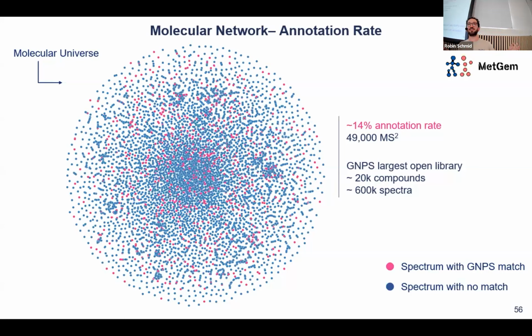Now you might ask me, is it better than molecular networking? No. Is it different? Yeah. Because to me, at least, those 2D representations of a very, very high dimensional space are very hard to do, right? There's spectral similarity. We saw that for those polyphenolic glycosides, right? There is some similarity of the glucosides to polyphenols and so on, but then in the end, there's also similarity to so many other compound classes.